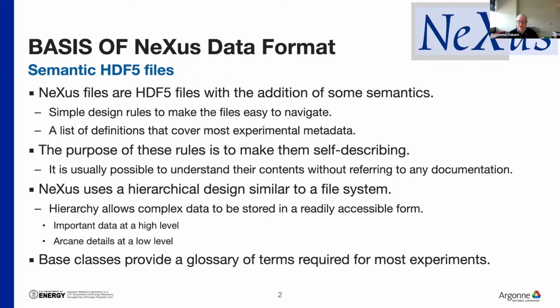So Nexus files, as I say, are now all stored as HDF5. But what they do is add just some semantics. Those are design rules, which mean that you can open any Nexus file without looking at any documentation and have a reasonable idea of what it contains and what the different components mean. As I say, the purpose of these rules is to make them self-describing.